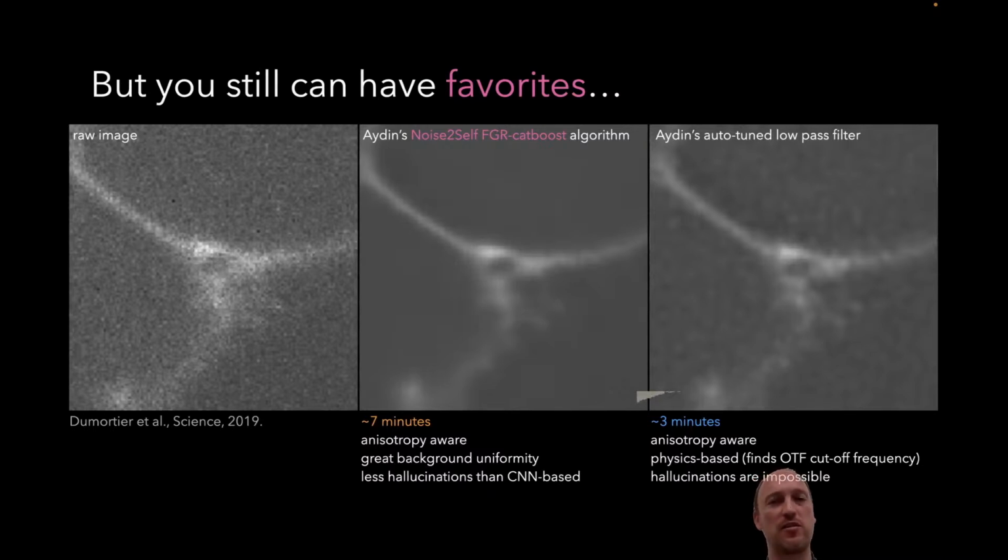collected, definitely much less susceptible to hallucination. And that's also perhaps because it is actually less powerful at imputation than CNNs. But the truth is that perhaps denoising is not, in most cases, so complex a task that it requires the power of CNNs. So that's a little bit the argument we have here, that perhaps there's a middle ground where you can have methods that are a little bit safer but still very powerful and also much faster.